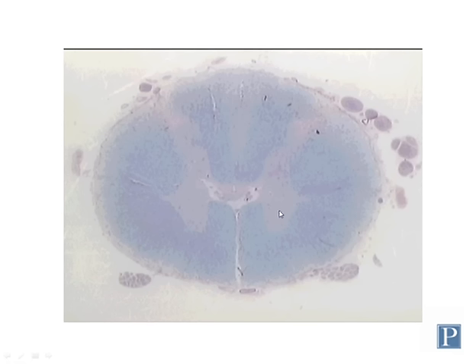These are the ventral horns here, and the ventral horns are found on the ventral or anterior side, so you can also call them the anterior horns. Note that they are fatter or wider than the dorsal horns, but they're shorter. They don't go all the way to the surface of the spinal cord like the dorsal horns do.